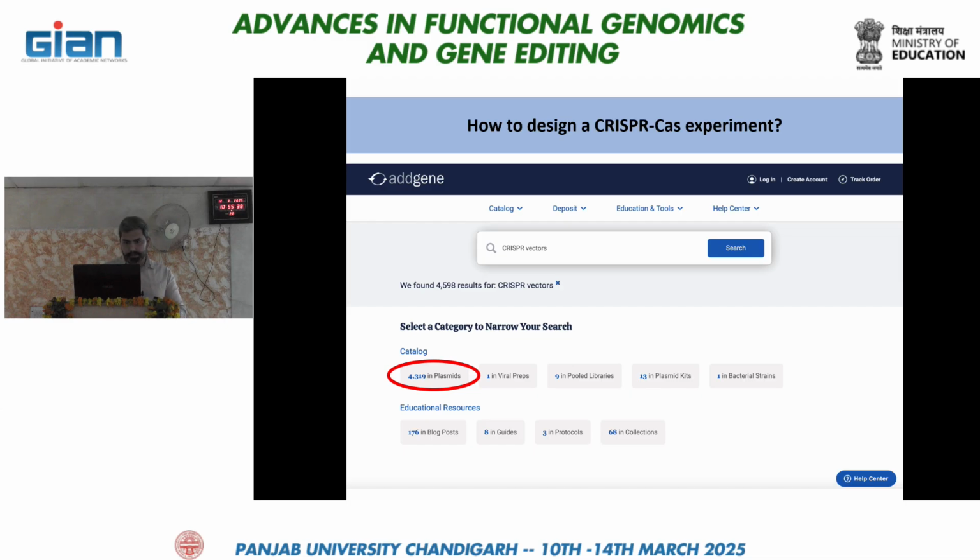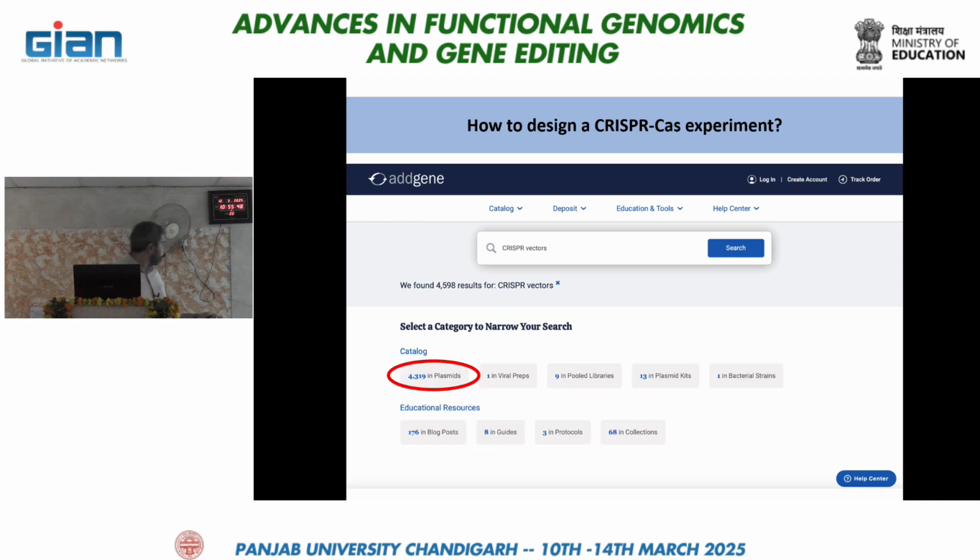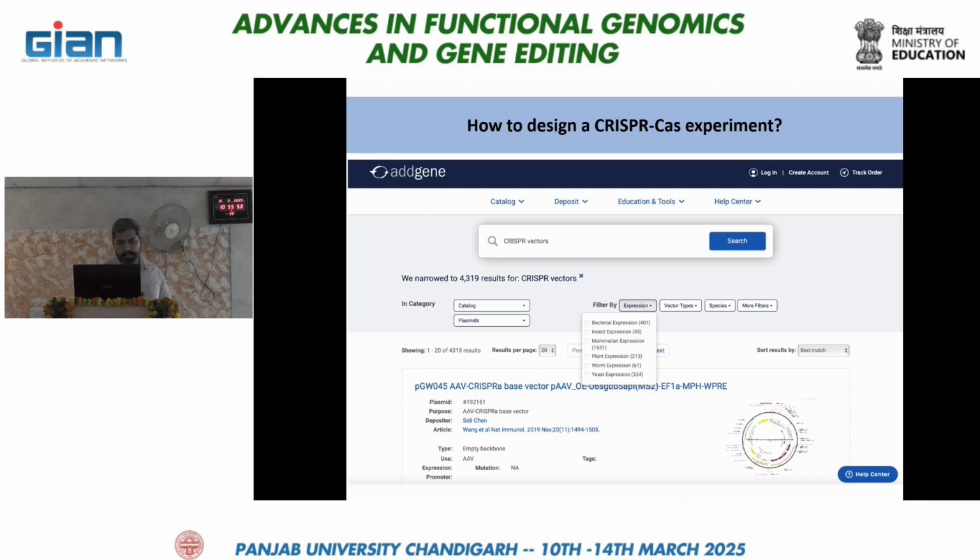Similarly, you can click these in the catalog, and after that you will get to open this page, and here you can see these filters. These are various parameters which you can alter according to your needs.